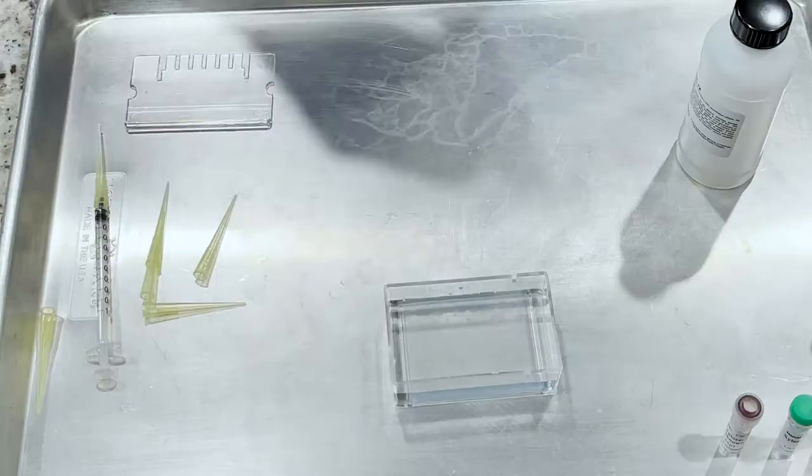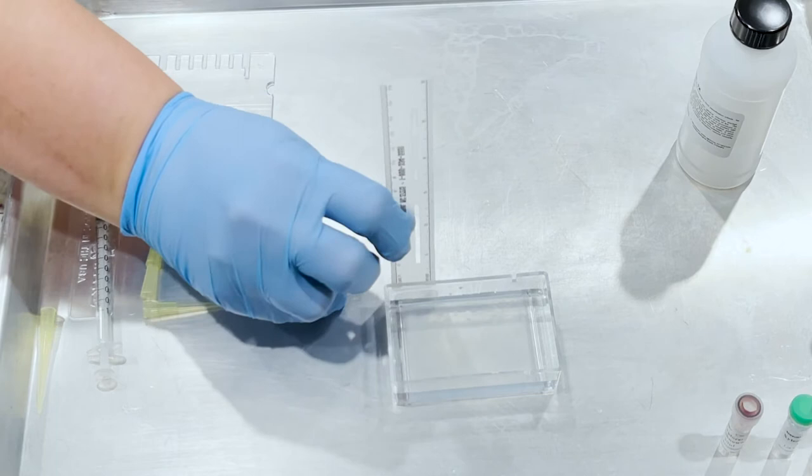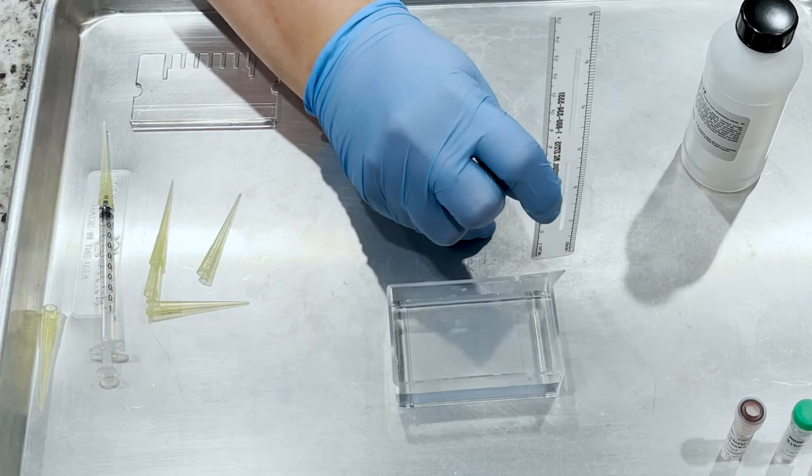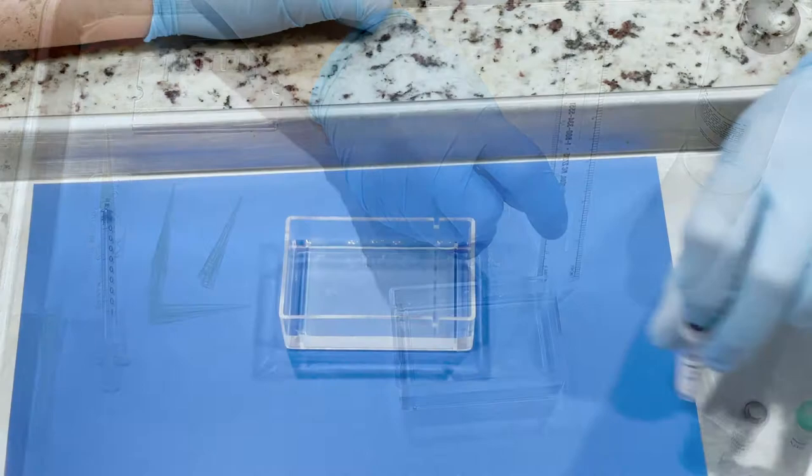The buffer should completely cover the gel. You'll notice here I wasn't sure if I had enough buffer or too much, so I pulled out my ruler just to check. I actually had a little too much buffer so I ended up pouring some off. That's totally fine to do if you accidentally pour too much, but basically it should cover the gel well and just have maybe a couple of millimeters above it. You'll notice that I put the gel box against a dark background because it helps me to see the wells better.